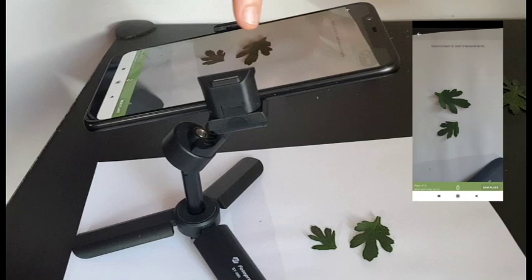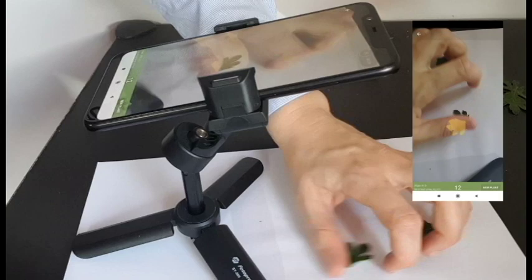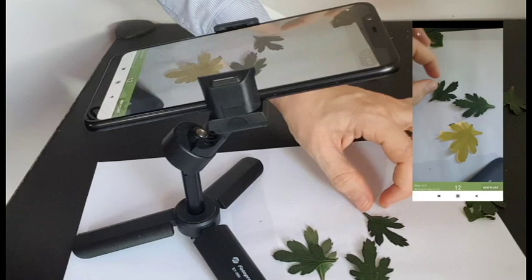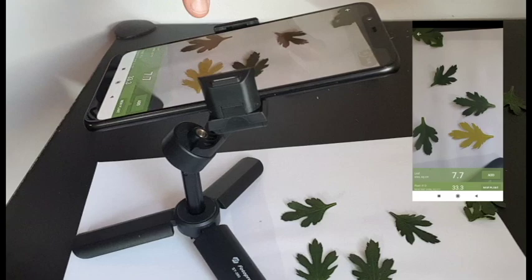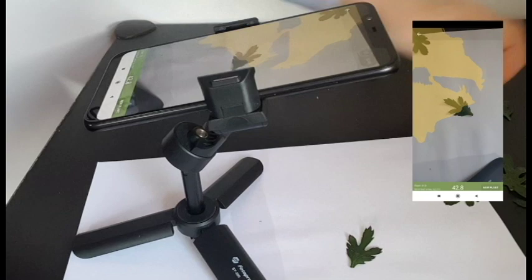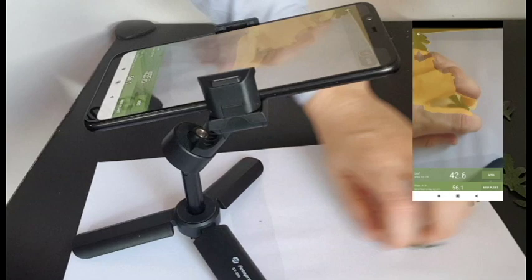On the screen you will see the button Continue — press it and then place the leaf in front of the camera. Touch the leaf in the center and you will see the area for each leaf. Then press the button Add, which makes it possible to add all the areas measured so you can calculate the sum of area for 10 or more leaves. I continue placing leaves in front of the camera, adding each individual area to find the total leaf area for all 10 leaves.